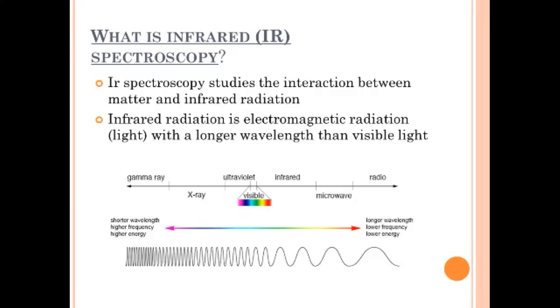Well, IR is a particular part of the EM spectrum, that is the electromagnetic spectrum, with a longer wavelength than visible light. A long wavelength means light carrying less energy. It also means a small wave number. Infrared spectroscopy is not created equal. It can be subdivided depending on wavelength into near, mid, and far infrared, although mostly mid-infrared is meant when the term IR spectroscopy is used.